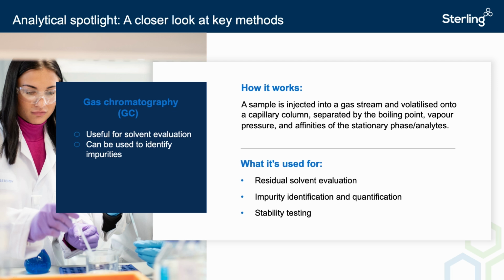There are different types of detectors in gas chromatography. The most common detector used in our lab is the flame ionization detector, or FID. This uses the hydrogen flame to ionize the organic compounds, solvents, APIs, etc. The ionized analytes are then measured and the signal is plotted.